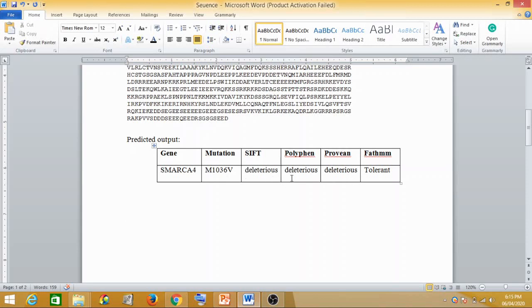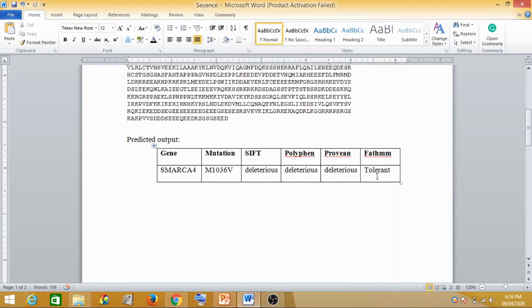That's why this is the whole point that I tried showing you. Mutation assays using four. If for three it would have gotten tolerant and one it would have been deleterious, then we would have gone for tolerant. If it was two deleterious and then two tolerant, then we would have to look for some other approach or some other tool which could prove this. This is how actually mutational analysis is done. You cannot just rely on any one source. Technically speaking, SIFT and PolyPhen are considered as gold standard scores. So you do any of these analysis, NGS analysis or any of them, whatever scores it throws out is your SIFT or the PolyPhen score itself. But as I said, these are only just part of two approaches. There are other approaches which are there, and it's always better to see whether the mutation or analyze your mutation using all the approaches, so that you are very much pretty clear.